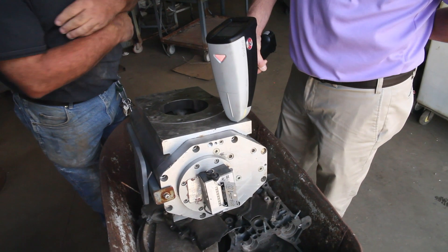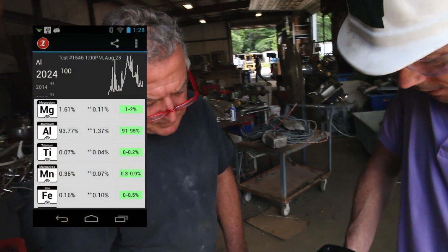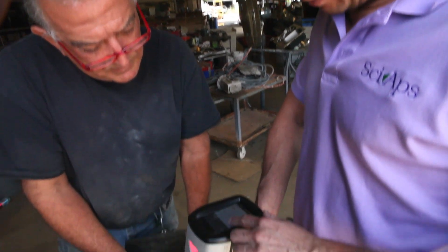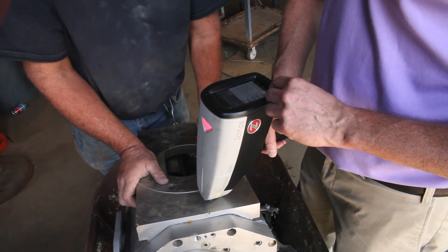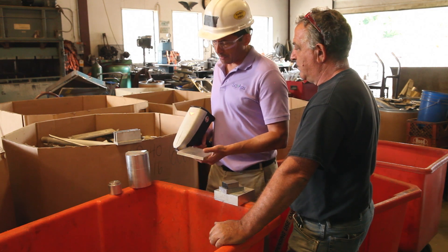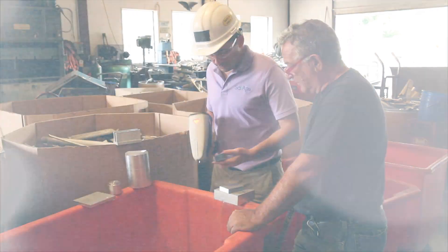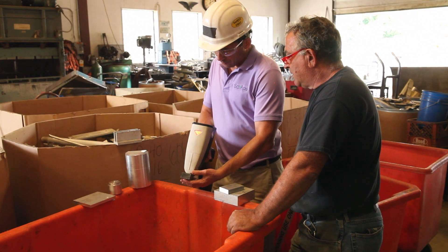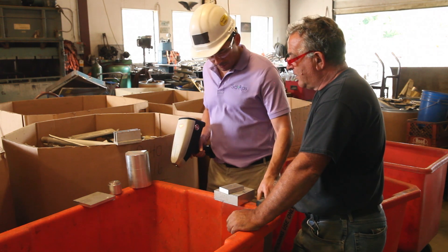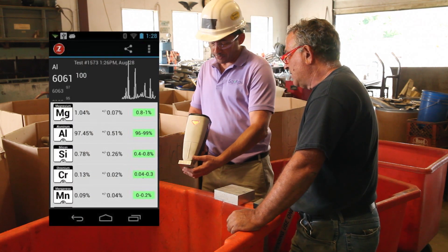So you shoot this — it's come up as a cast aluminum, which is not surprising because it looks like a cast aluminum. It's come up with a 2000 series, which is kind of typical — you've got high copper. X-ray's fast on some things, but this is much faster than aluminum, about 10 times faster. So now it's worth sorting this stuff. That's a 7000 — 70, 75. So you don't want to mix these guys up. You leave money on the table. If you sell it as a 6000 series and it's a bunch of 7000, what does that mean?